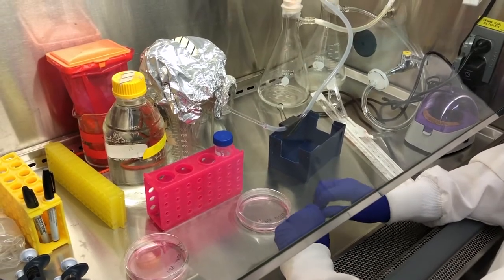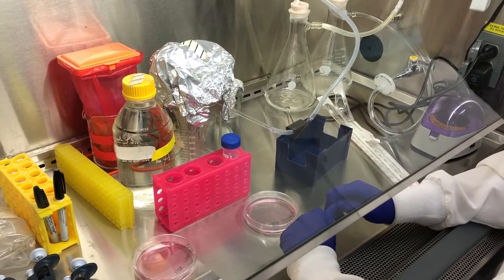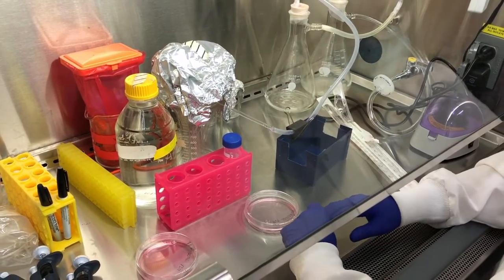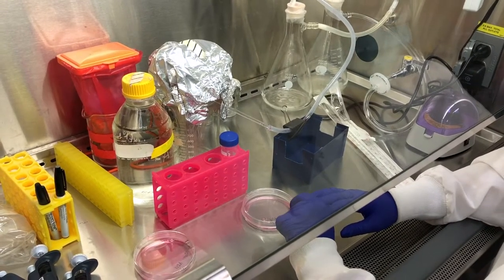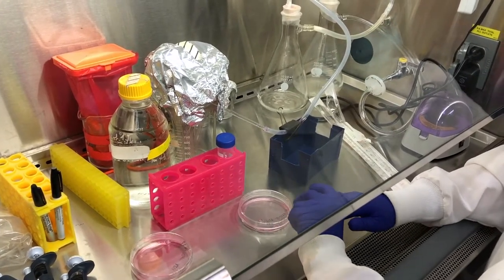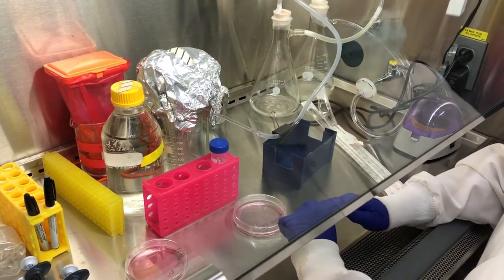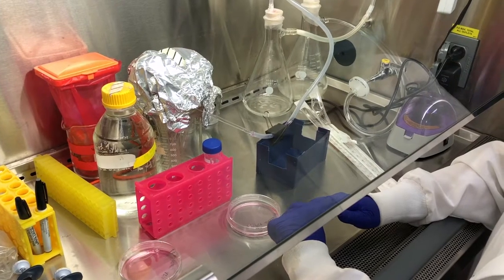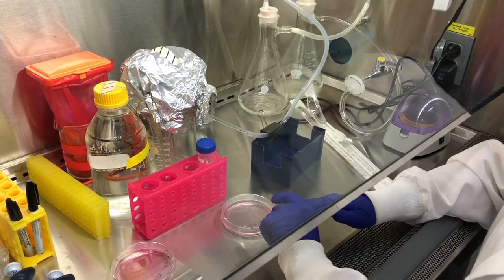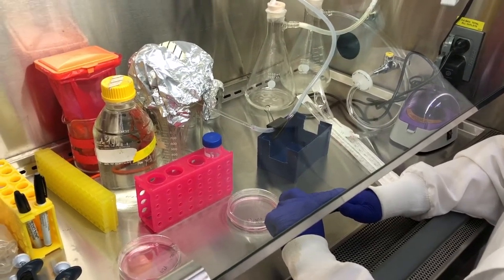Like I said, there's a variety of ways you can passage your cells. So I would recommend writing it all down ahead of time and calculating out exactly what you're going to do. I hope you found this video helpful and I wish you all the luck in cell culture work. Thank you.